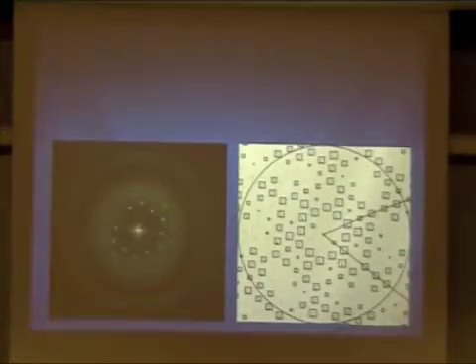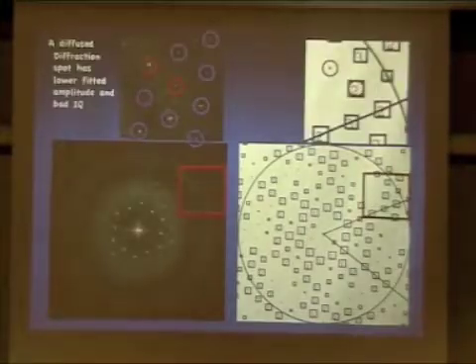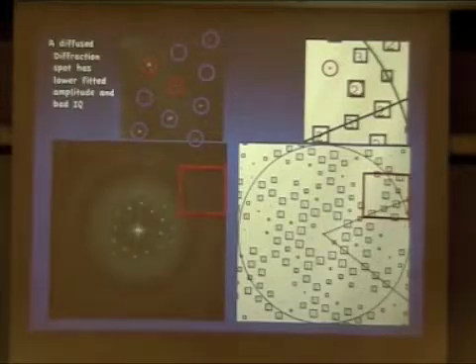Okay. So with those two things there, the end result of this part is that we changed from a computed Fourier transform into values in the IQ, into amplitude, phase, and also IQ values at each spot, as you can see on the right. So we often just look at the spot and see what's going on. Because of what I just said about how it's actually determining these values, there are certain things that you will observe.